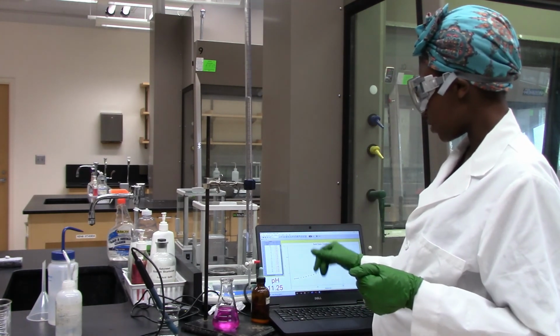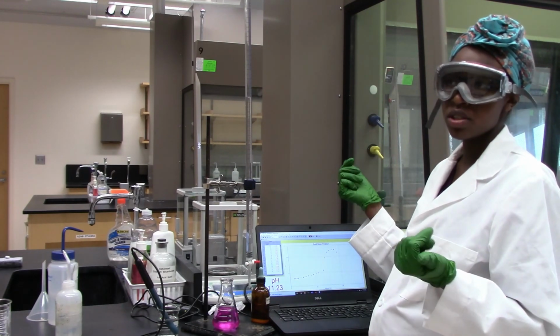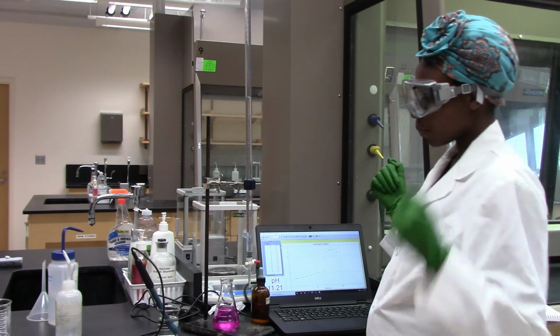And this should give us the pH change and then the Ka values that we need, and the volumes that we need to calculate the moles and the molar mass of our unknown solution. So this is it.